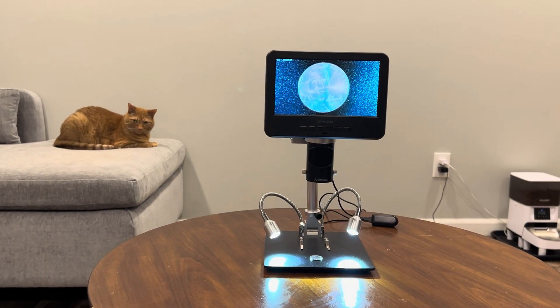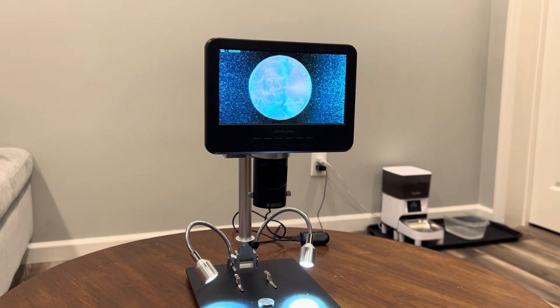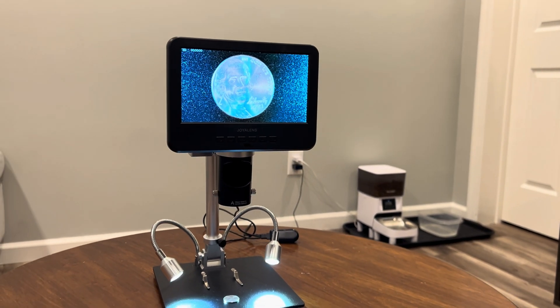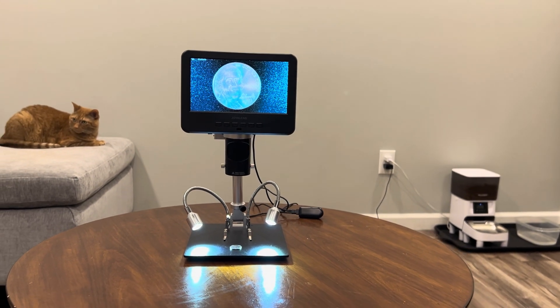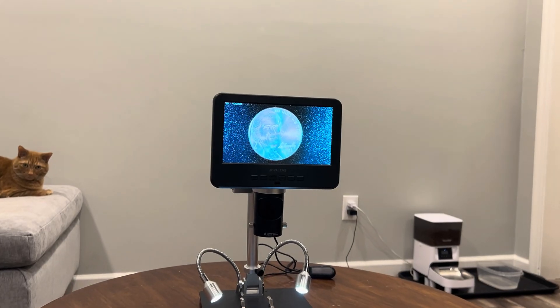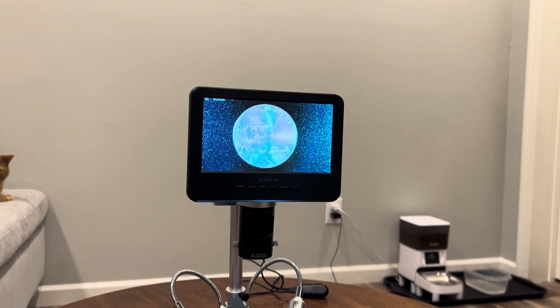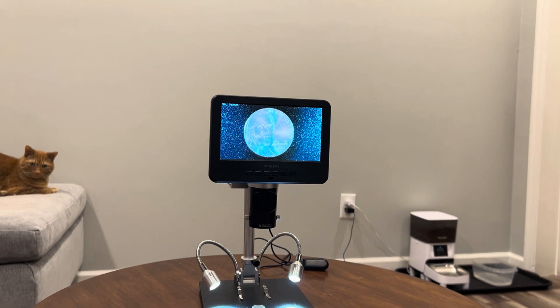In this video, we're going to be taking an in-depth look at the Joya Lens Digital Microscope, model number JL246MS. This digital microscope boasts some impressive features like a 7-inch HD display, up to 1,200 times magnification, and even the ability to take high-quality photos and videos. So whether you're a student or a professional, this could be a game-changer for your work or your projects.